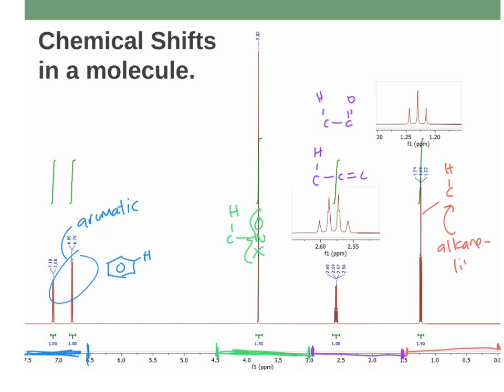It's just kind of plain, boring sp3s, Cs and Hs. So that'd be the most shielded one, right? So again, the terminologies: this is the most shielded signal. This is the most de-shielded signal. This one's the most upfield. This is the most downfield. Right, so we should be able to predict forwards and backwards what these structural things are.